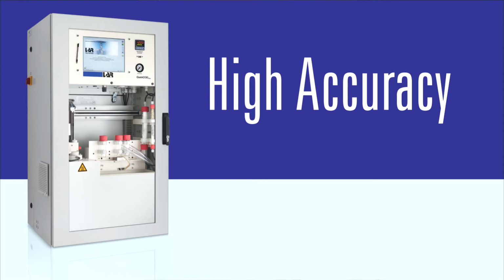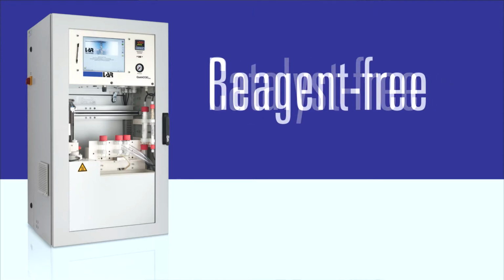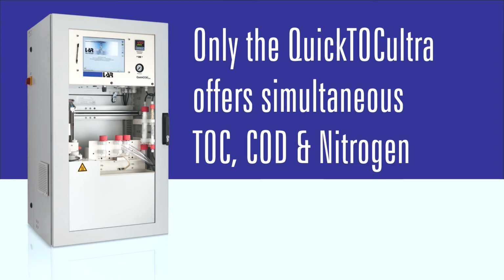Many years of development have resulted in an analyzer that achieves high accuracy without catalysts or reagents. Maintenance requirements are low and uptime is high with 98% availability. The QuickTOCultra measures up to 6 streams sequentially and is the only TOC analyzer that is configurable to also measure total bonded nitrogen and COD alongside TOC.